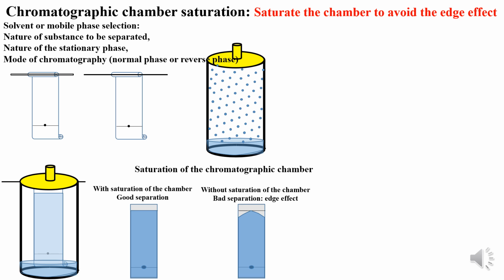So saturation of the chamber is a must, and this is to avoid the edge effect. And how do you select the solvent system, and what is the criteria or basis for selecting the solvent?